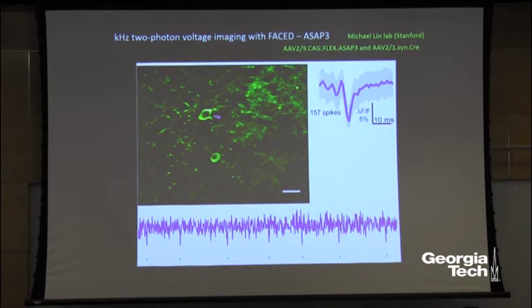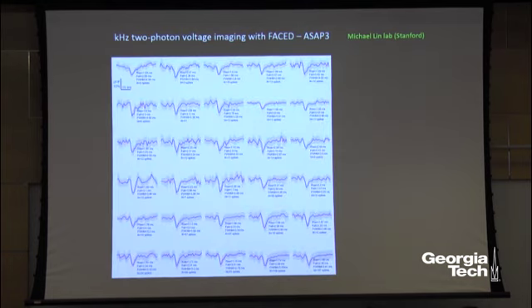We are doing a more sparse label here. And again, you can see this deflection, and this neuron fired 157 spikes in about the same number of seconds. If we put all the traces together, you can see that it's pretty clear there's something there. But then, of course, am I just giving you the publication typical example? And just to say that, no.